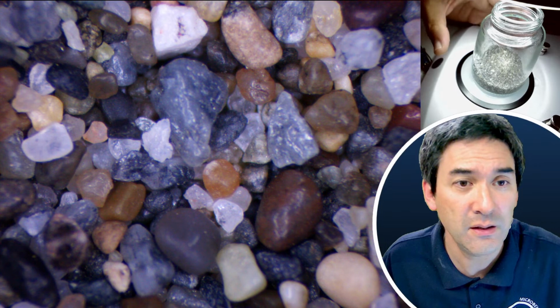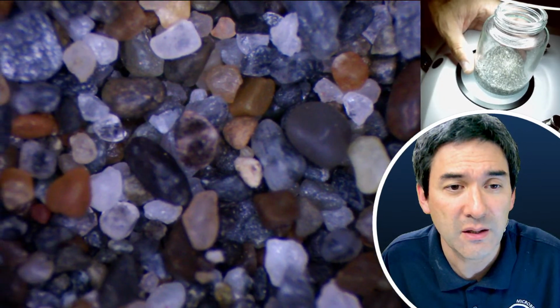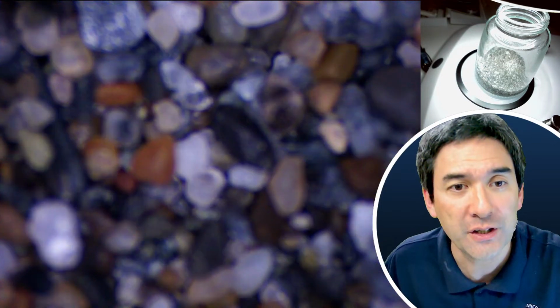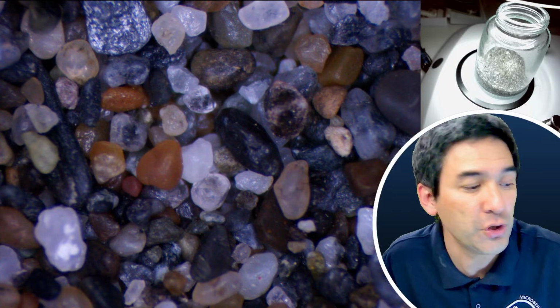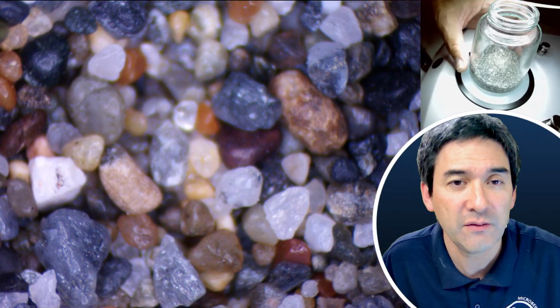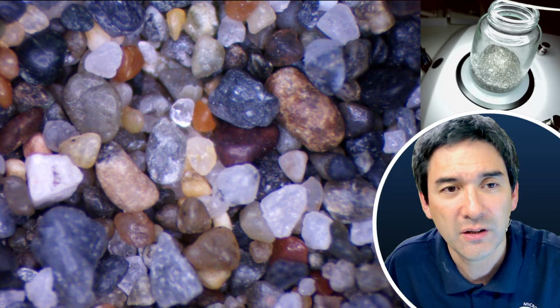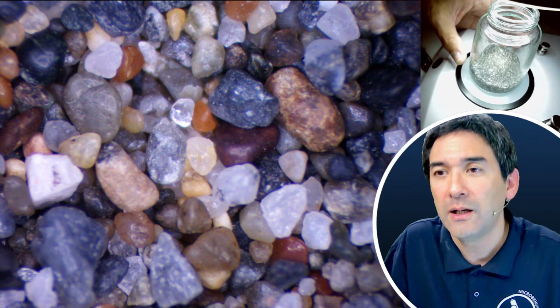Okay, so see, some of them have a few corners, so I think this tells you also something maybe about the age, how long the sand particles have been in nature, and maybe also something about the hardness. I mean, there are some folks who are polishing their own stones in a so-called rock tumbler to get very nicely polished rocks. And here we see that many of them look just like those tumble polished rocks.